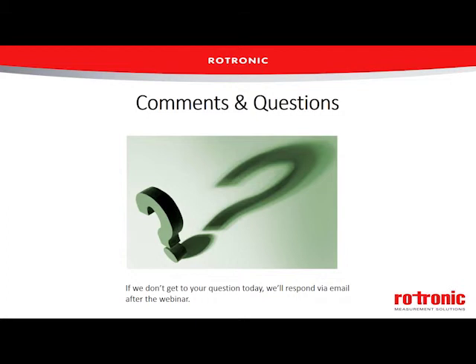Okay, thanks. Here's an interesting one too. These guys are coming up with some good questions this time, Michael. Why can saturated salt solutions remain stable regarding RH percent even at different temperatures?